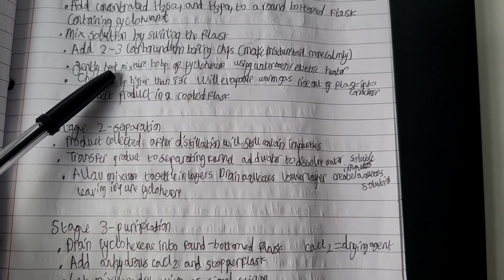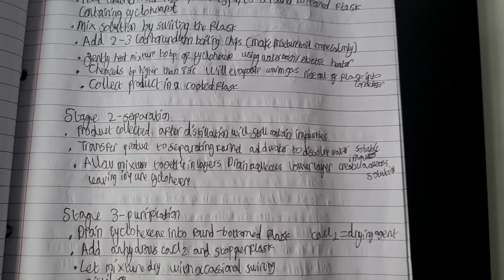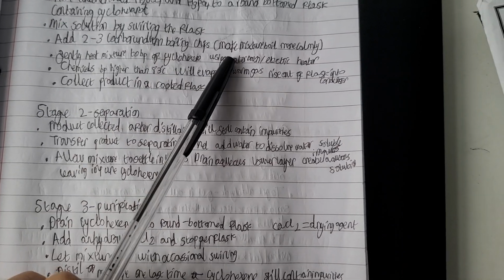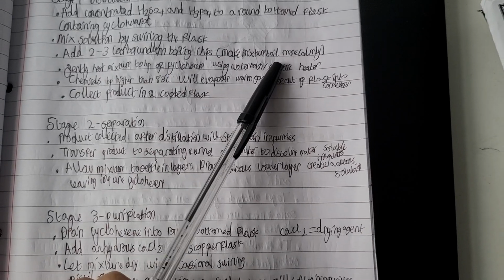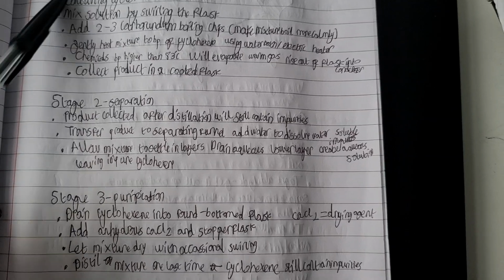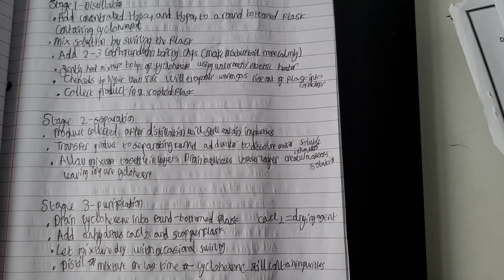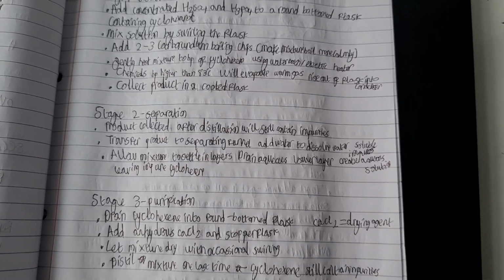Then we want to gently heat the mixture to the boiling point of cyclohexene, which is 83 degrees Celsius. How are we going to do this? We're going to use a water bath / electric heater, one or the other. The reason I included both is because in the exam it could be showing you stages. Sometimes they show stages, and it could be like state another piece of equipment that could be used to gently heat the mixture to the boiling point of cyclohexene, and they've already included water bath. Well, the other one is electric heater.